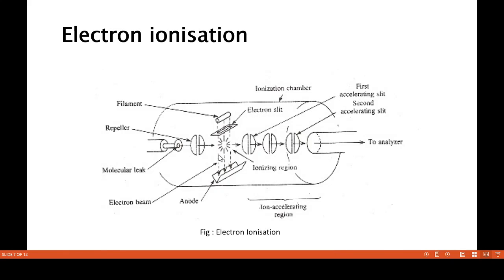The fragmented positive ions are accelerated into the ion accelerating region, while the negative electrons are accelerated towards the anode.